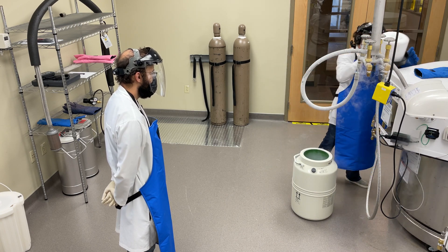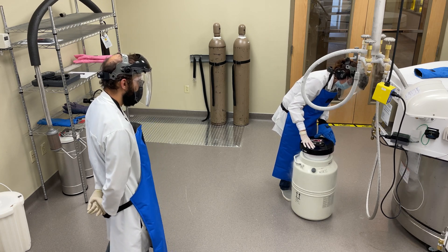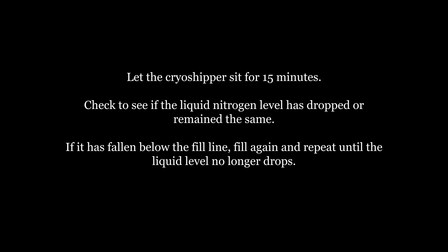Replace the foam cryoshipper lid. Let the cryoshipper sit for 15 minutes.